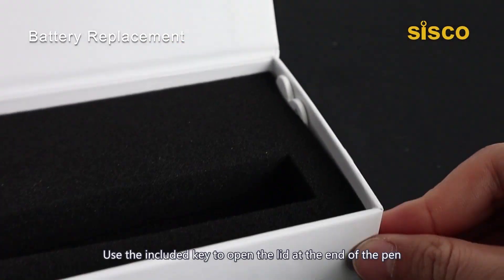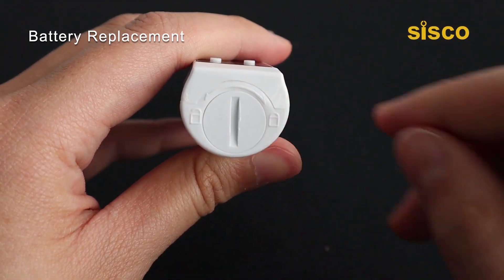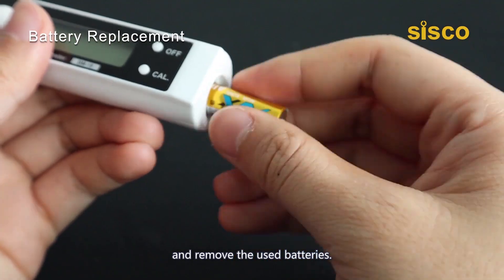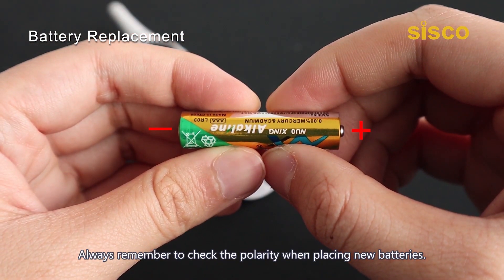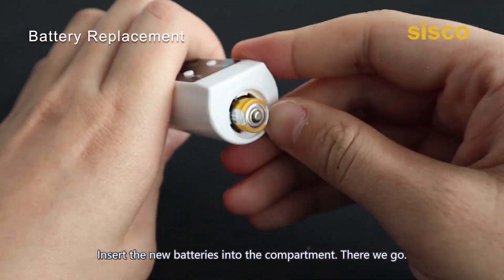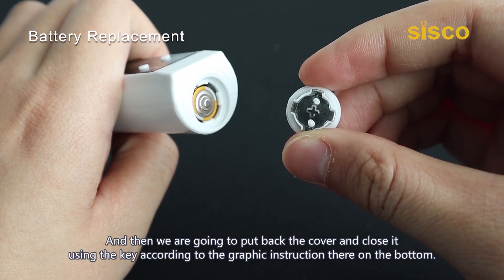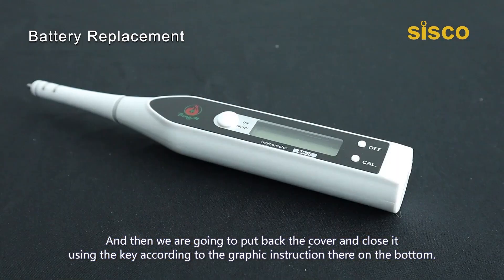Use the included key to open the lid at the end of the pen and remove the used batteries. Always remember to track the polarity when placing new batteries. Insert the new batteries into the compartment, then put back the cover and close it using the key according to the graphic instruction on the bottom.